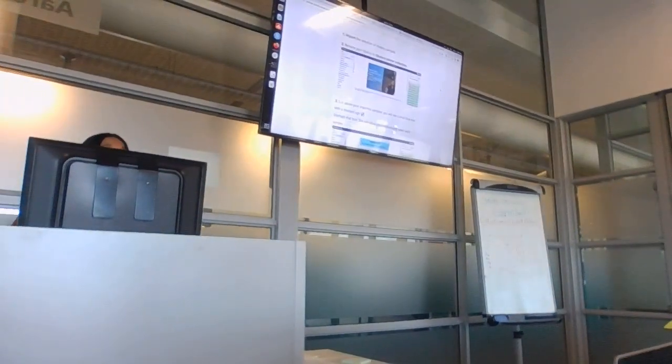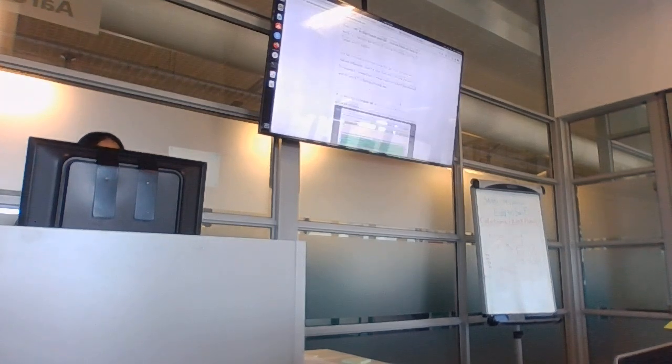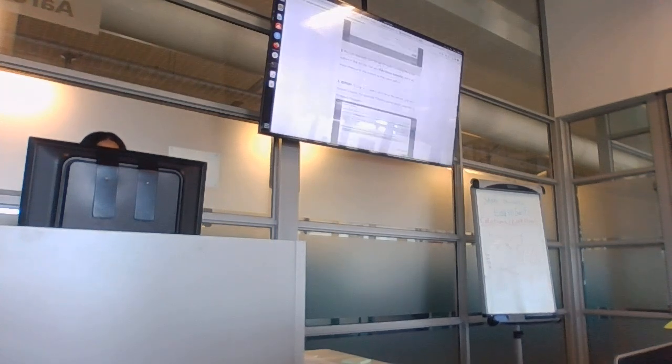This is literally everything that I did, from import, naming the workflow, checking the box and unchecking the box, select all, building it. You could actually repeat this at home. We use the same data sets, the same samples, so you can follow it through. This is how to make a collection.